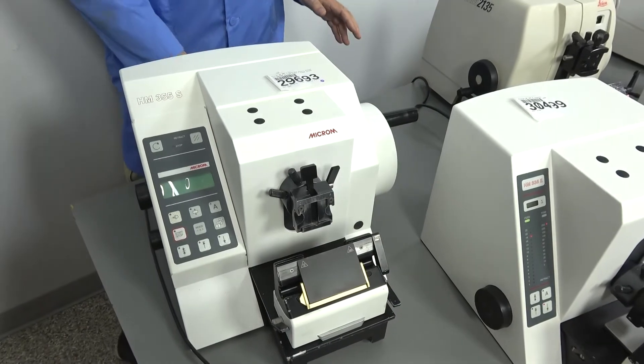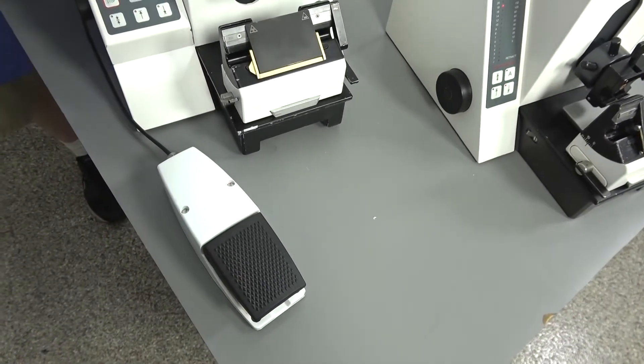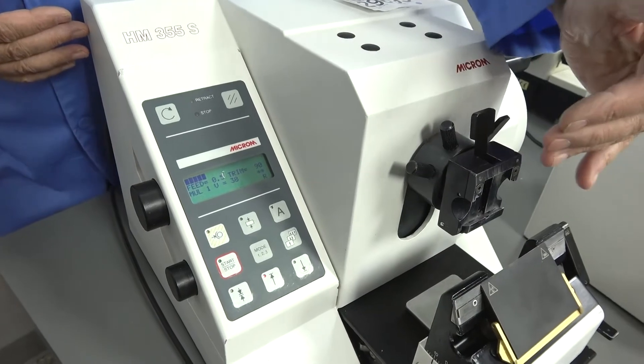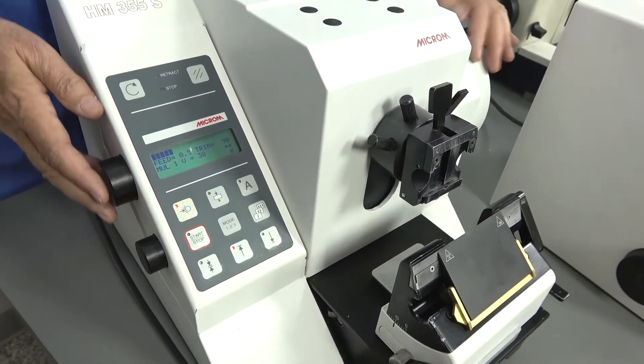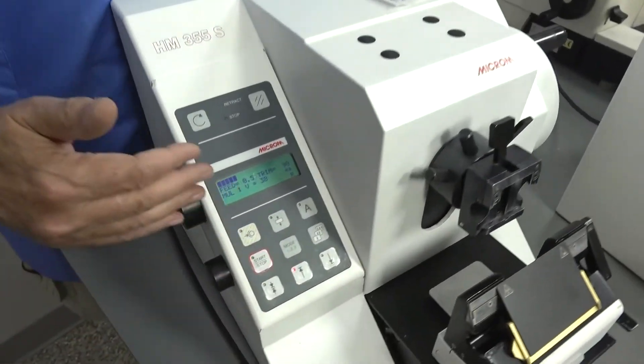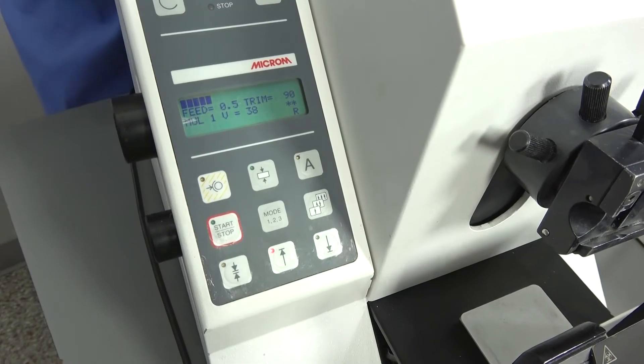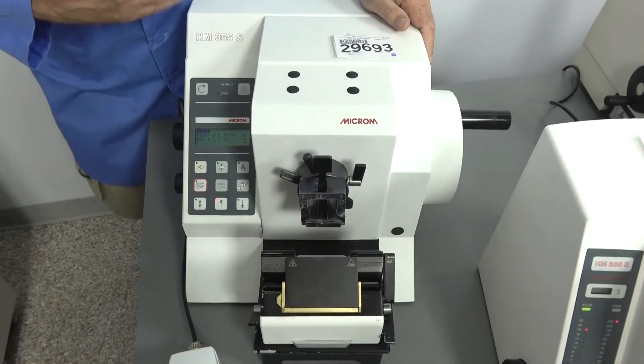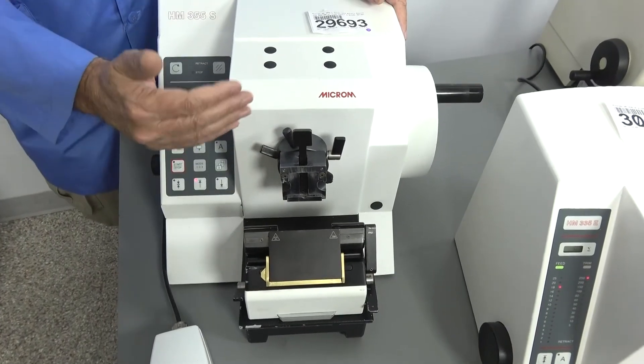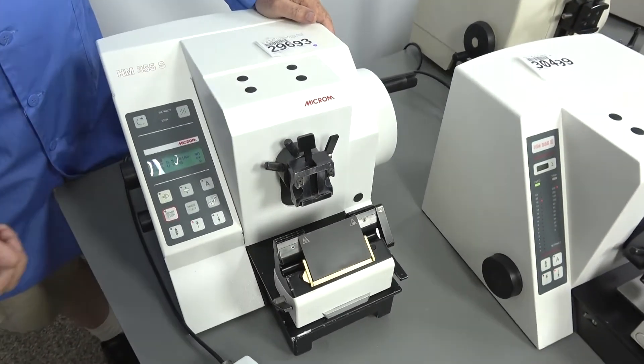Then you get into your full motorized electronic units. You can use a pedal option, all sorts of feedback as far as how much you have left to go in the stroke, electronic blade lock so that it doesn't move even though there's an emergency stop on it, all sorts of feedback. You can set your controls to run continuously or until you press the button again, go a single stroke, go multiple strokes, go just until you press that blade. There is just a host of options, including window setting, which only makes sense in a motorized unit because it will change the speed of the motorized cut to give you a better finish on your cut and a better slide, which is what you're after.